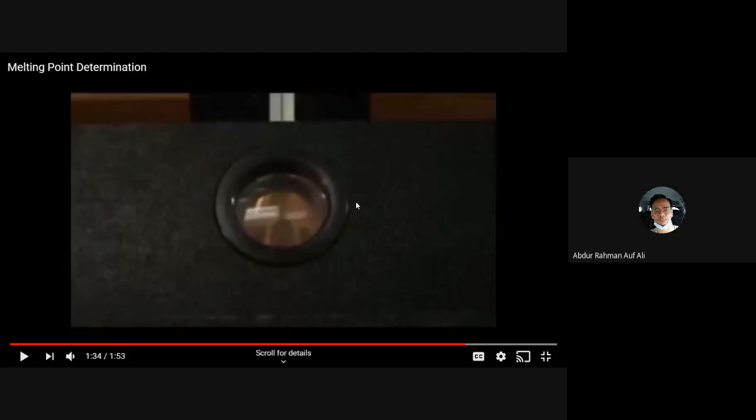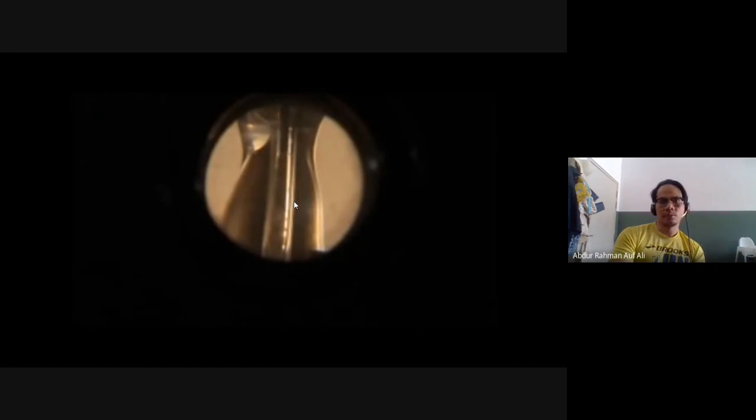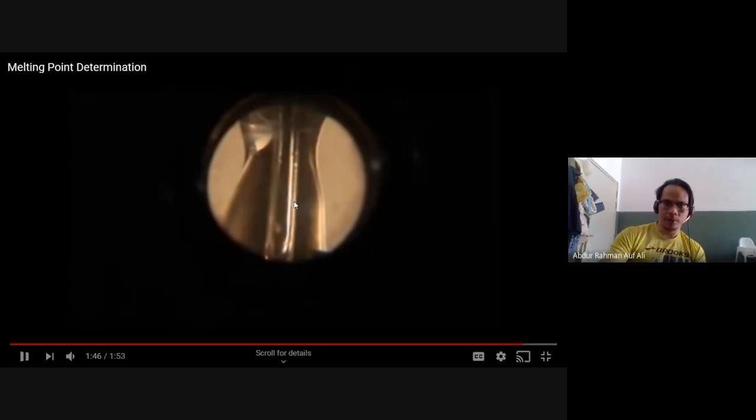So he see the magnifying glass where you put the capillary tube yang mengandungi our sample tadi tu, you can observe the sample here. So kamu boleh nampak lah bila dah start melt, kamu tengok the temperature. And then when it's melted completely, dah jadi betul-betul liquid, colorless solution like this, you record the temperature that it dan dia cair completely.